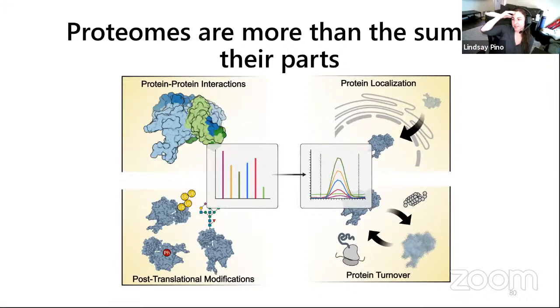Raja, it appears that spectral library is a must in analyzing PTMs. That's not true. So that's true for me in this particular instance. But for doing things like phospho, there are excellent phospho repositories out there. And there's several algorithms that you can use to analyze PTMs in DIA data.